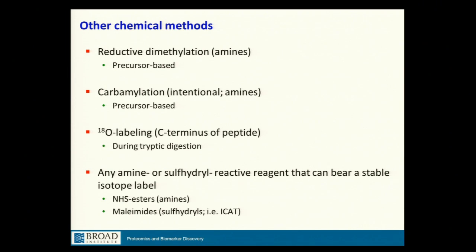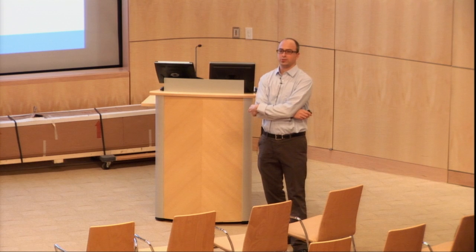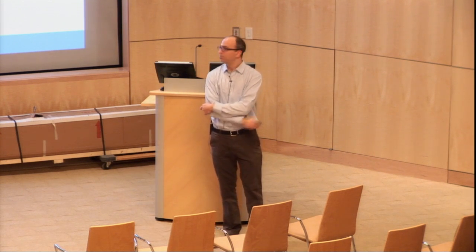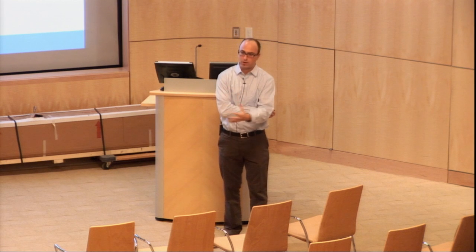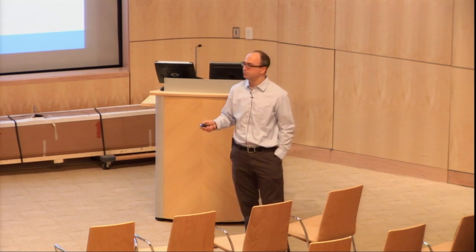Okay. Is it comparable to SILAC in terms of the protein peptide ID? Yep. That's actually quite a thorny question. So the question was, is it comparable to SILAC in terms of protein number and peptide ID? And for the most part, it is. There are some properties of the iTRAQ 4-plex reagent that actually make it slightly better than regular peptides in a proteomic experiment. They tend to retain better on a column. They tend to fragment more efficiently. Their ionization is boosted.